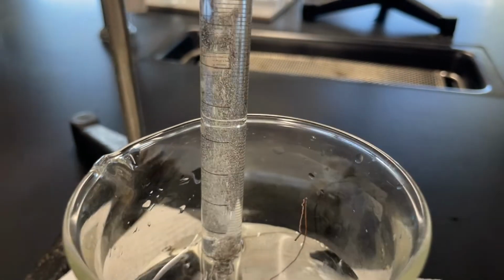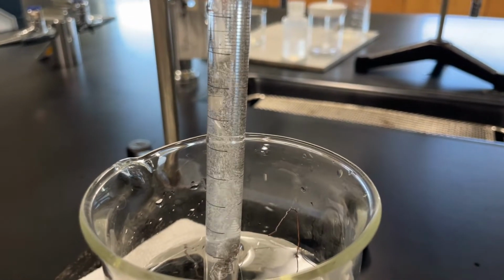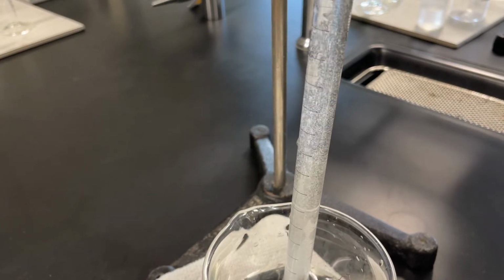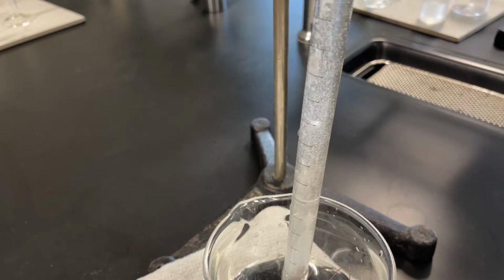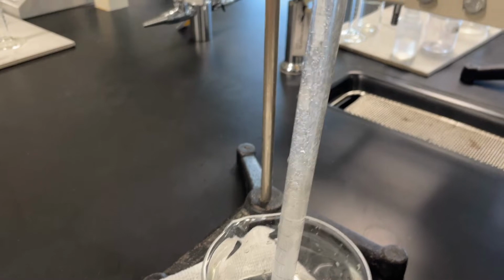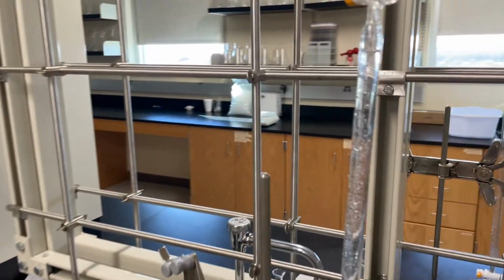We'll continue to let the reaction take its course. Eventually we'll stop seeing bubbles, so we'll stop seeing evidence of a chemical reaction, and we will assume that it has completed. We'll be sure to tap on the burette to get any lingering bubbles off of the copper wire and off of the side of the glass as well. So we will have captured all of the hydrogen gas.